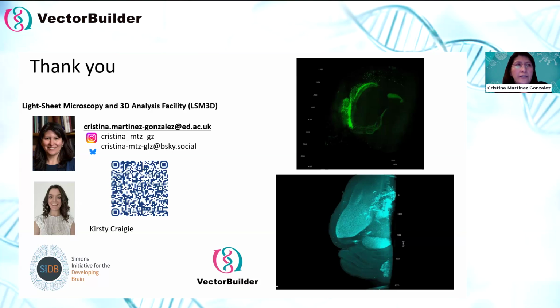For antibodies, a lot of mistakes happen when people get an antibody that they just bought recently. I will go to the literature, especially papers with clearing methods, which normally publish the antibodies that are compatible with their clearing methods and which ones are not. For example, for my method, most of the antibodies need to be compatible with the methanol dehydrations. In our paper, we publish a large list of which ones work and which ones do not work. So instead of choosing a paper just for your research, look at a paper with the clearing method you want and look at the list they publish.